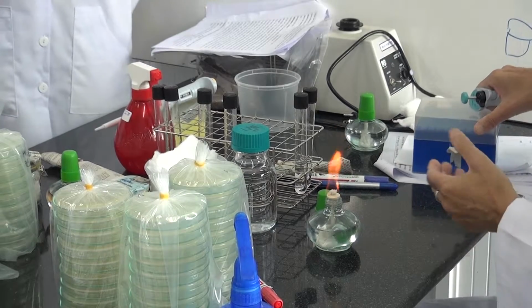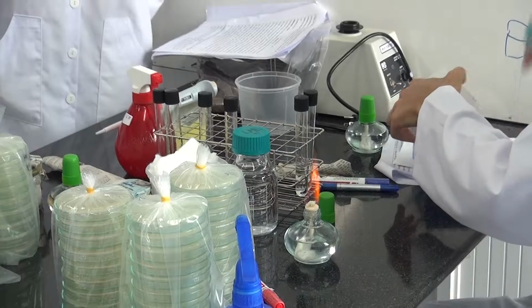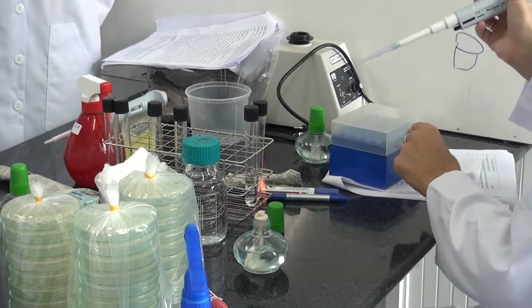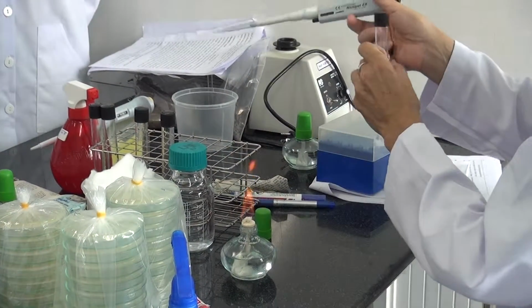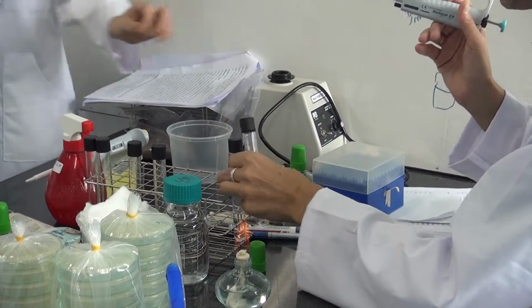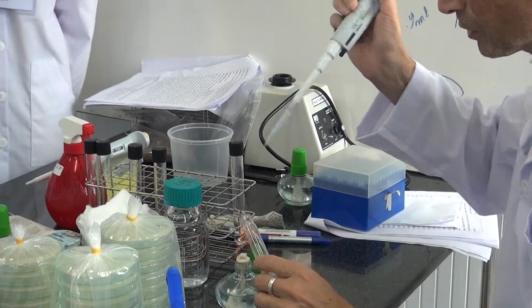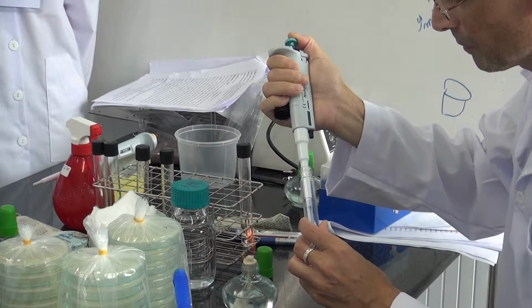Of course, one has to be careful and to work as fast as you can, open the tubes. Okay. Then work near the flame, just like this. Take your sample.